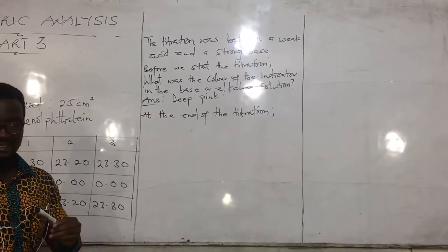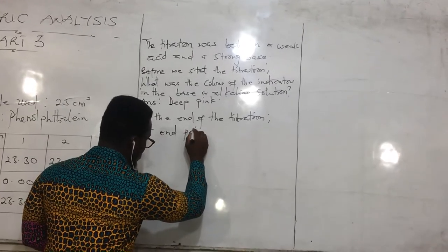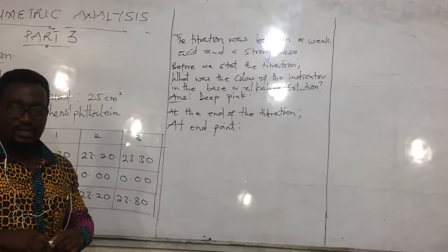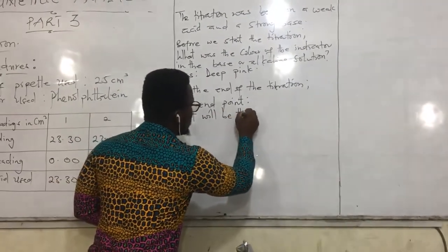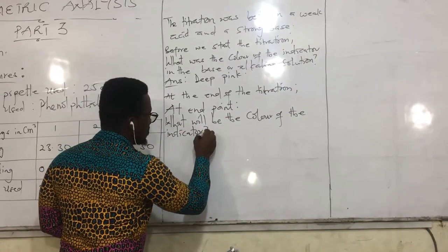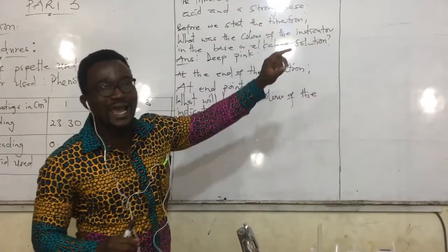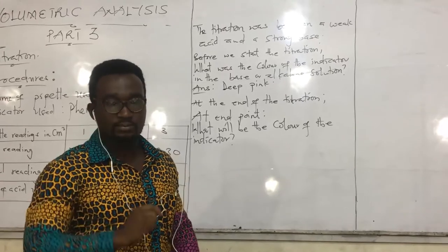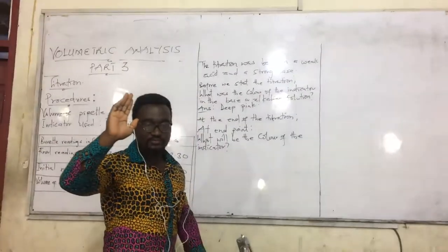at the end of titration, that is the end point. At end point, what would be the color of the indicator? We have already explained from theory that when you titrate a weak acid against a strong base, or a strong base against a weak acid, the solution will be alkaline in nature, which means the pH will range from 8 and thereabouts. So it will be basic in nature.